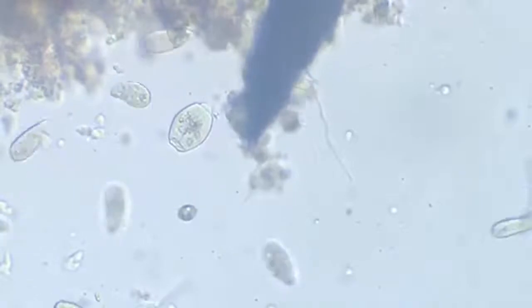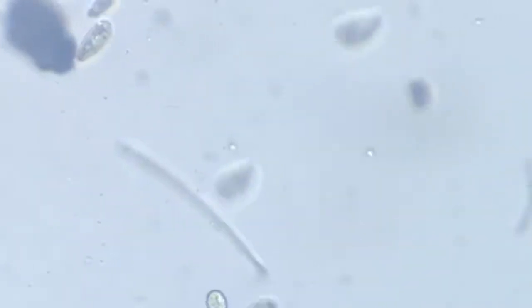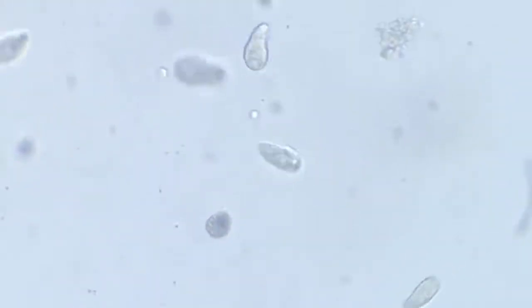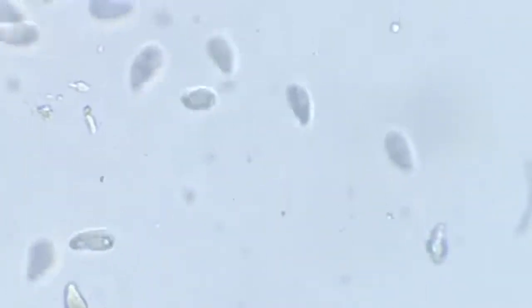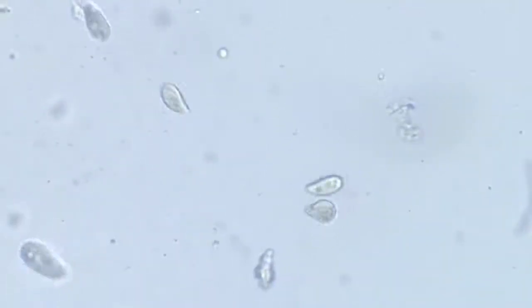So we saw some ciliates, we saw some vorticella, we saw some Blepharisma, and then we got to see some rotifers, and of course protozoa. Some algae also were there, and that's a huge amoeba. Even this one seems to be pretty big.